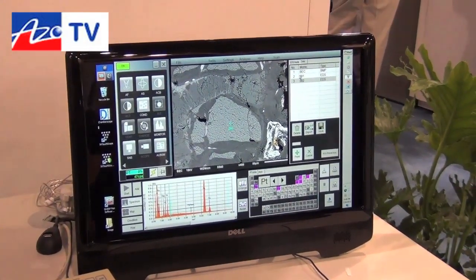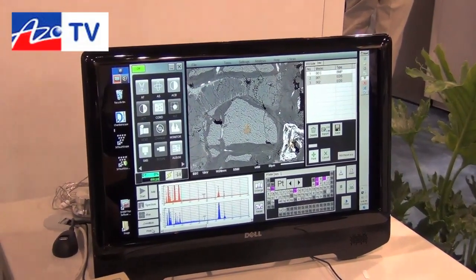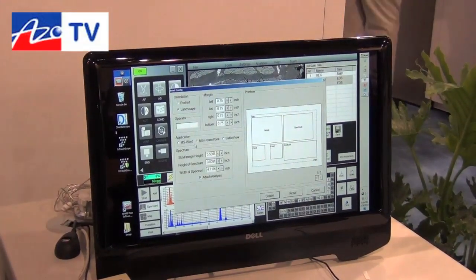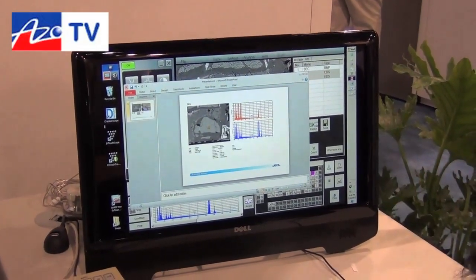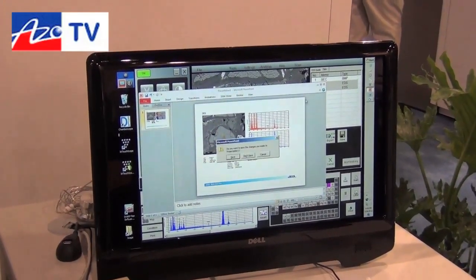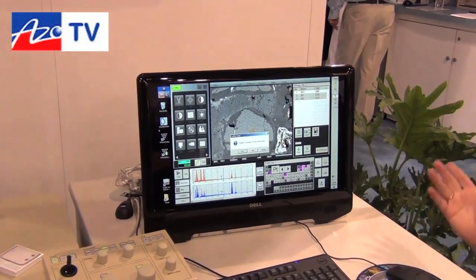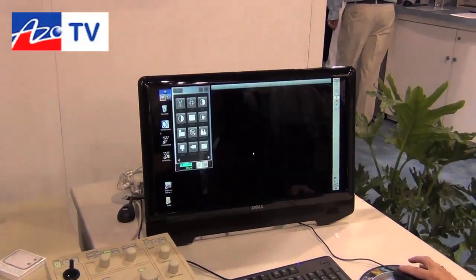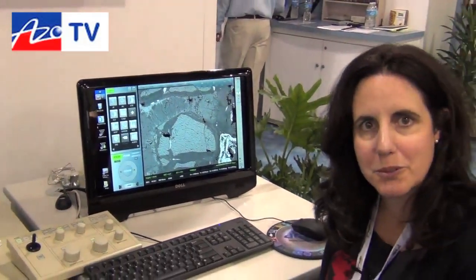Then if I want to, I can select the two spectra and to output the results I hit print, decide if I want Word or PowerPoint, and output the data into a report. It's very, very simple. When I'm finished, I go back to SEM mode and can move on to another sample. Very, very simple to operate.